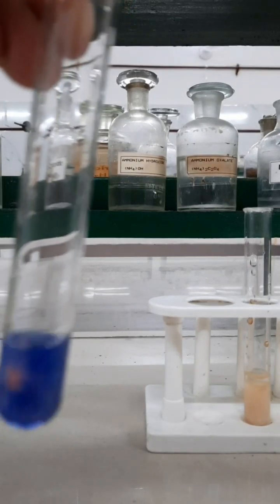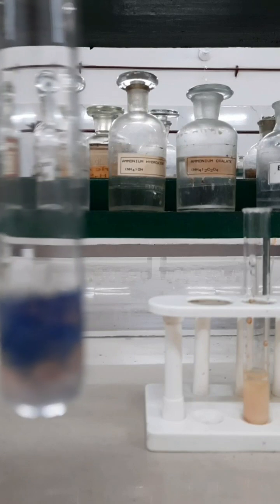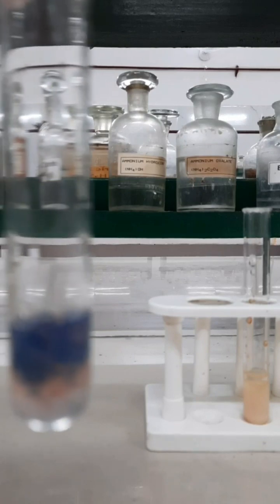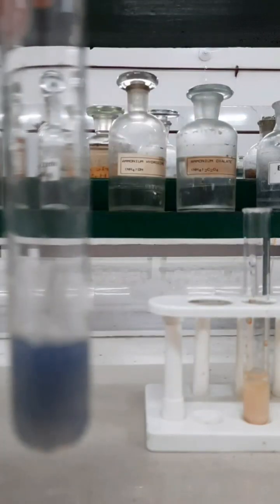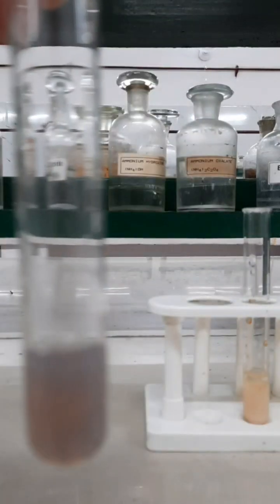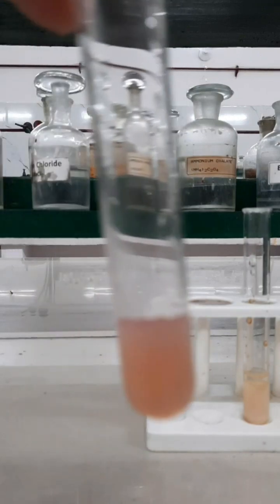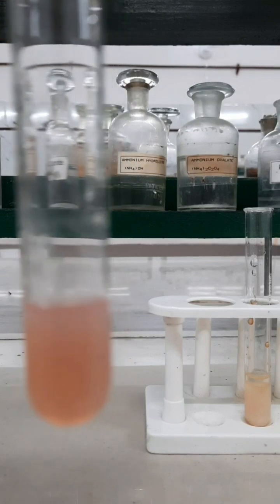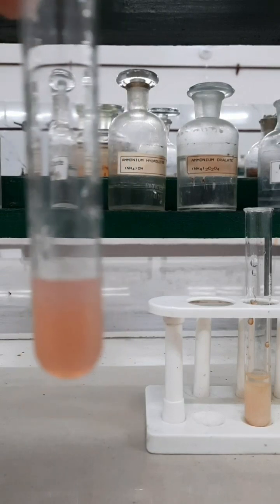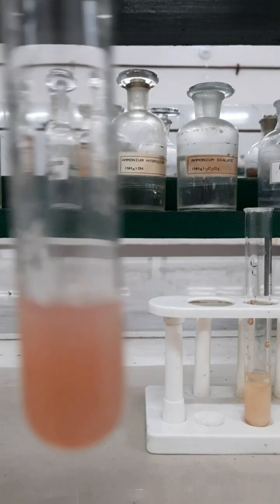First of all, a blue colored precipitate of cobalt hydroxide will be obtained and that will turn pink on standing, or you can see that a hydrated cobalt hydroxide complex will be obtained, and that will be pink in color. The color will turn from blue to pink, and this test is not given by the nickel 2+ ion.